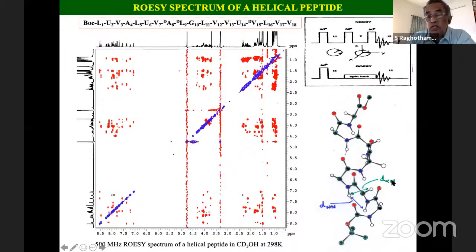Now because this is inter-residue, there won't be J coupling, but NOESY can pick it up because it comes nearby. So it's distance dependent. It can transfer magnetization from this NH to the adjacent NH, and this NH to the next adjacent NH. So likewise, you can pick up the sequence connectivity here. Now, the sequence connectivity combined with the J correlation connectivity, you can assign every peak in the given spectrum. Now, to stress on this, how this sequence connectivity helps in secondary structure assignment, as I said, in the helical cases, all these NH come nearby.